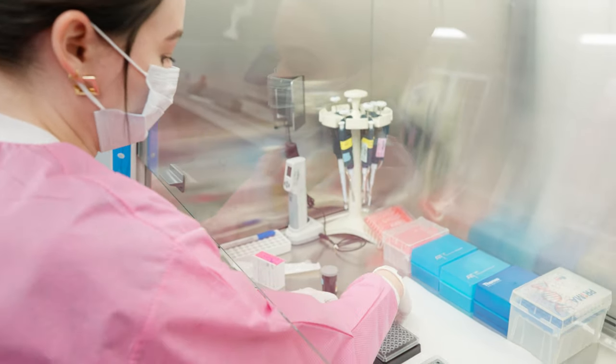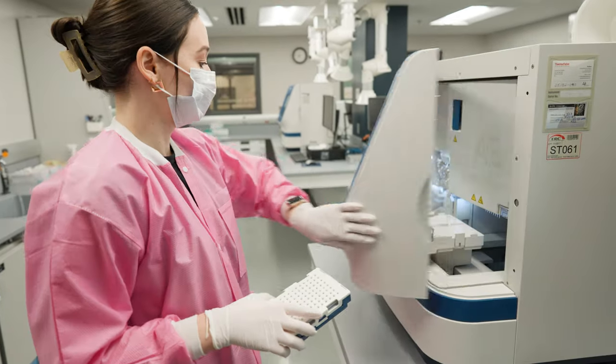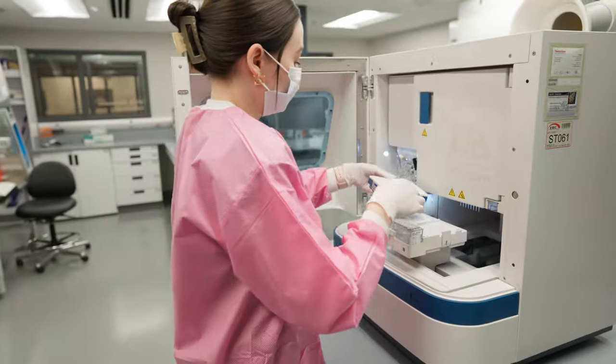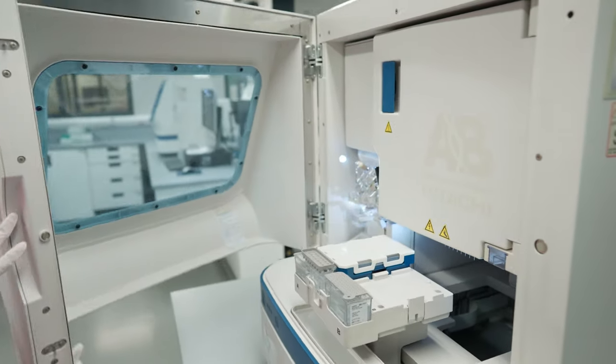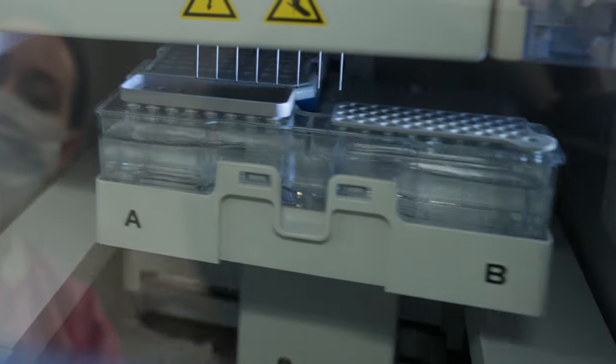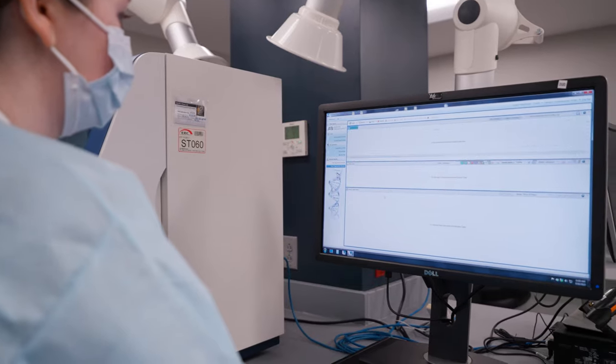The smaller fragments move more quickly and are detected before the larger fragments near the end of the capillary. A laser excites the fluorescent tags causing them to emit light. This light is captured by a highly specialized CCD camera that collects the light emission data. This data is converted into a DNA profile by genotyping software.